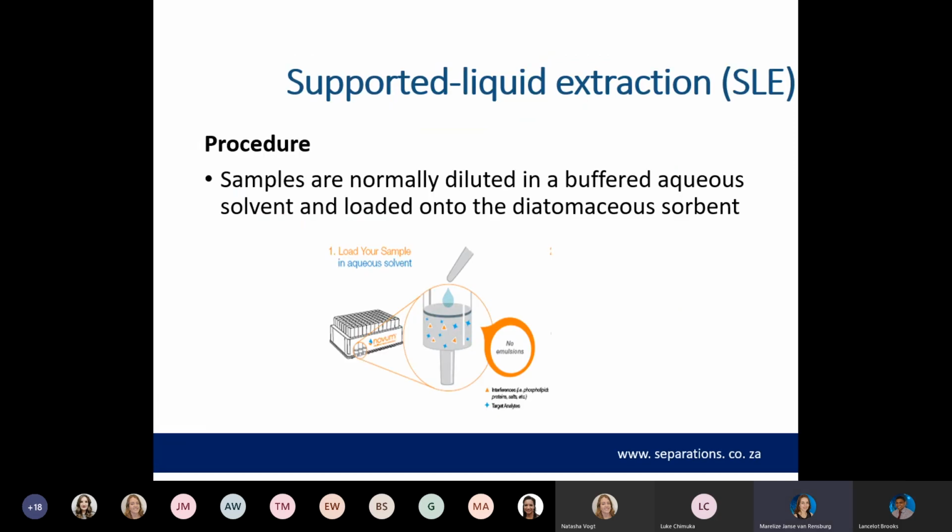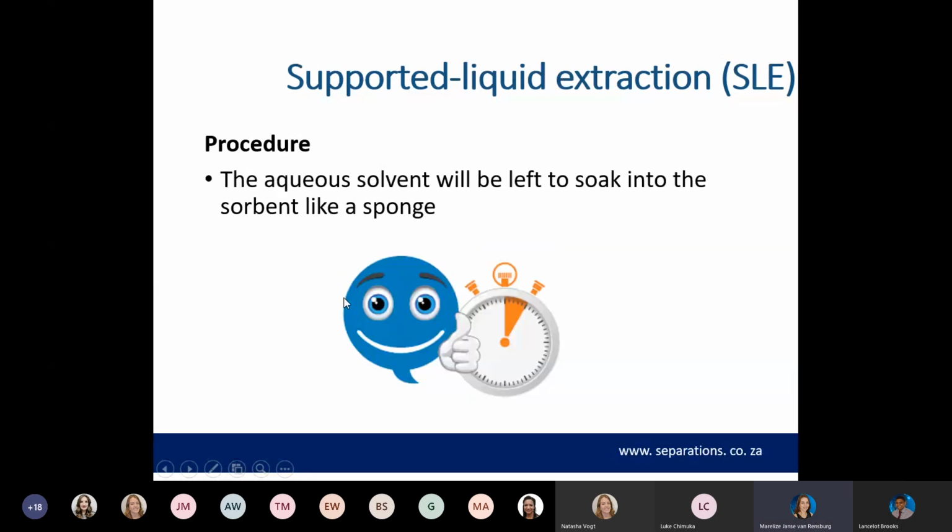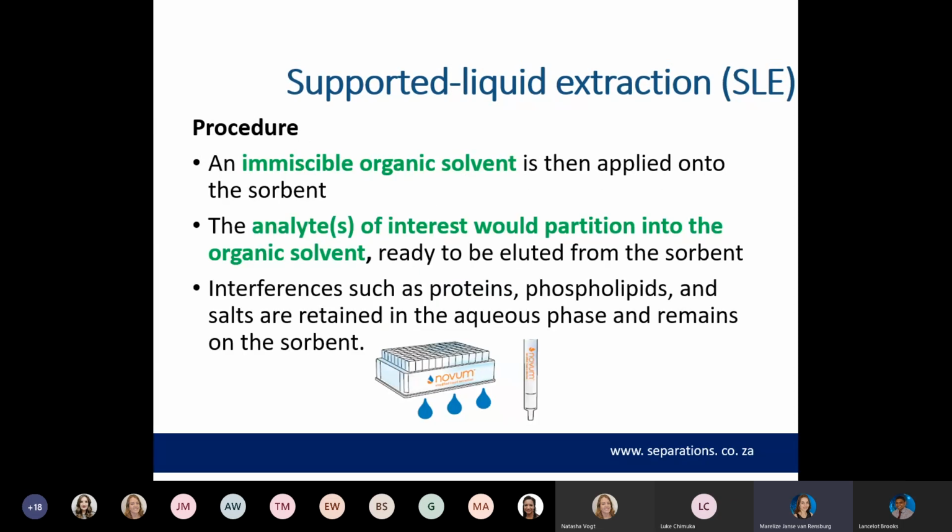How does it work? Quite simple. Your sample is normally diluted in a buffer and loaded onto the diatomaceous sorbent. The aqueous solvent will be left to soak into the sorbent like a sponge, so you give it a few minutes, and then you use your immiscible organic solvent, apply it to the sorbent, and your analyte of interest will partition into the organic solvent and be eluted from the plate.